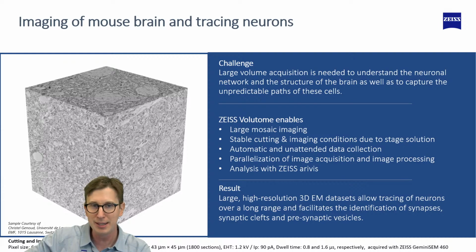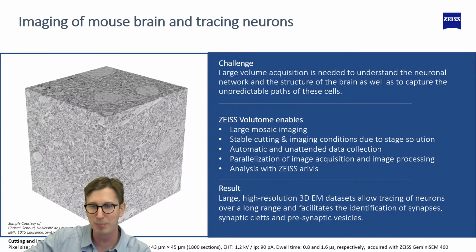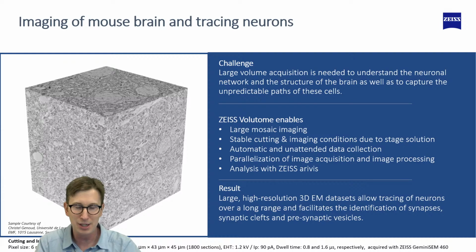Now, with this technique, we get details not just on single little lines of where those axons and neurons and all those synapses are, but we actually get subcellular details. So we could start asking questions of what are the mitochondria doing inside these neurons and how many synapses are coming off of these branched, very complicated neuronal processes. And so the Volutome is going to be giving us this large volume through this tissue here.